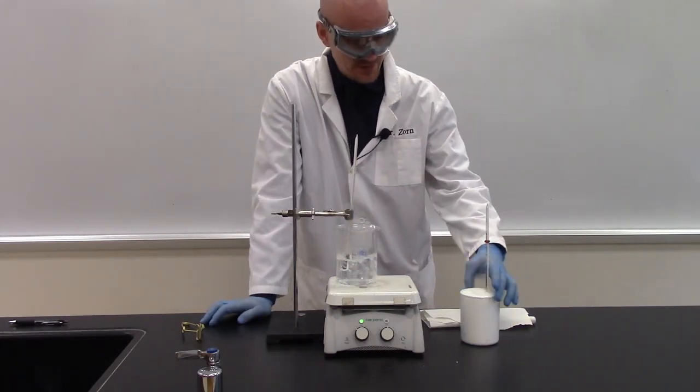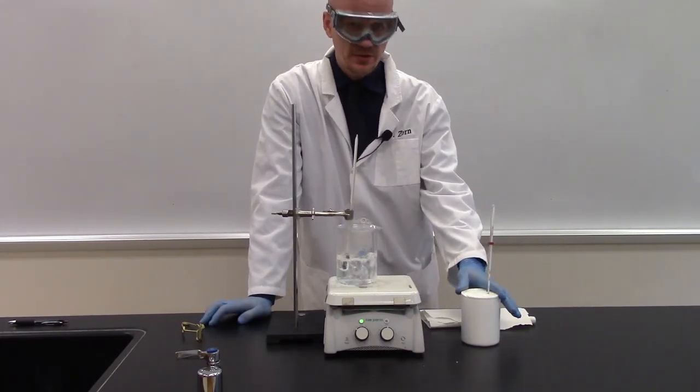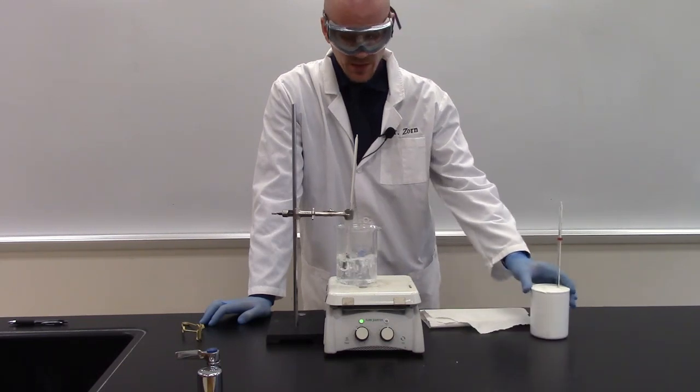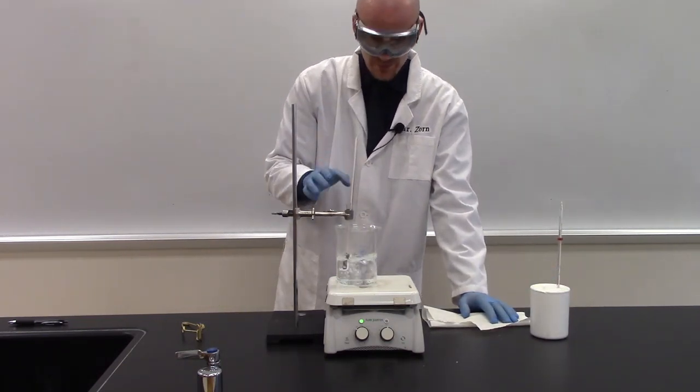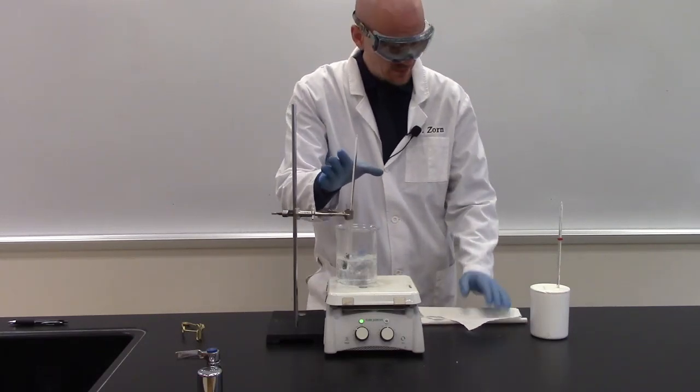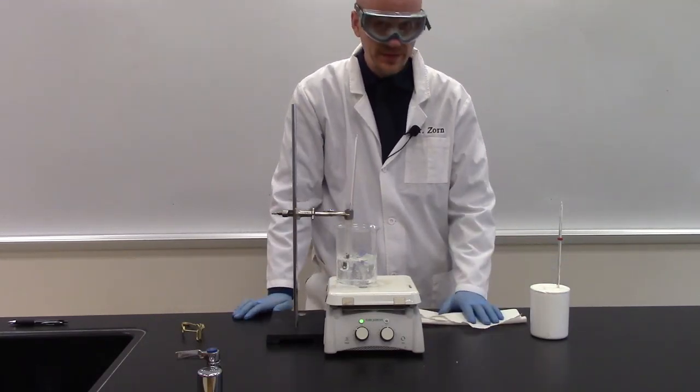So what you need to do first is note the temperature, the starting temperature of the calorimeter, and then you want to also note the temperature of the metal. So I've got my starting temperature of the metal and my starting temperature of the calorimeter.